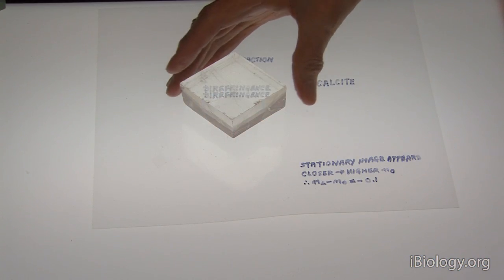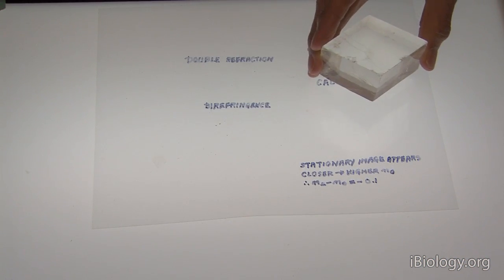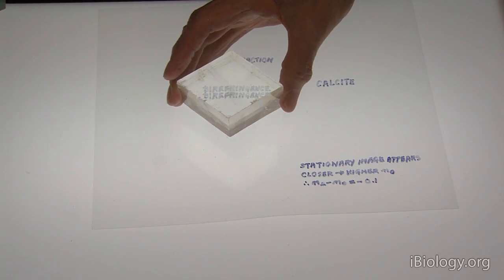Now, double refraction is the property that we use very often in biology. One of the properties of this double refraction is that the light that comes through the crystal, before just a single image, becomes double.